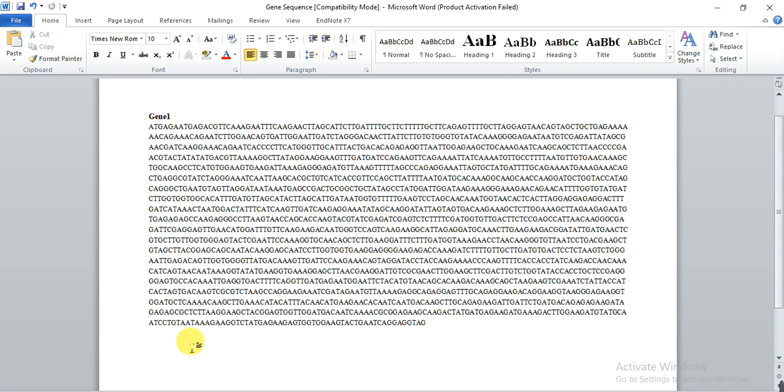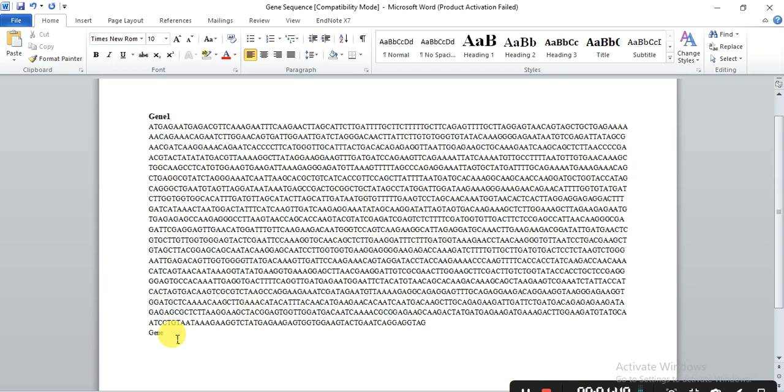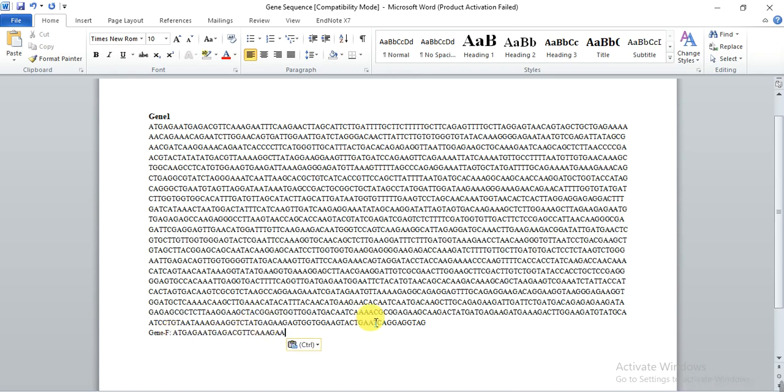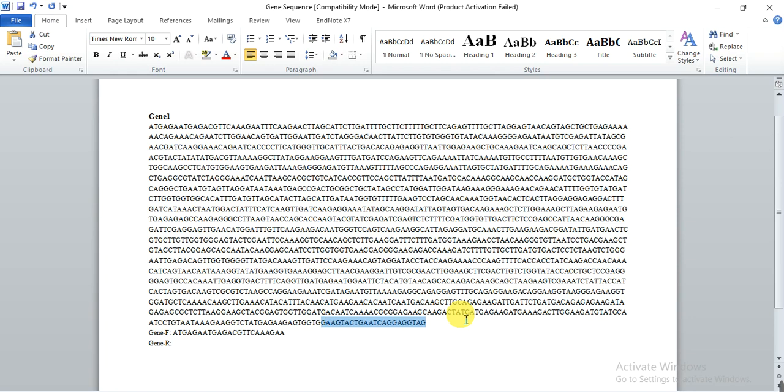And now I need the reverse primer that starts from here. It's stop codon but it is the reverse complement. So we also take about 22 to 23 base pairs - that is 1, 2, 3, 4, 5, 6, 7, 8, 9, 10, 11, 12, 13... 21, 22 - and then copy.